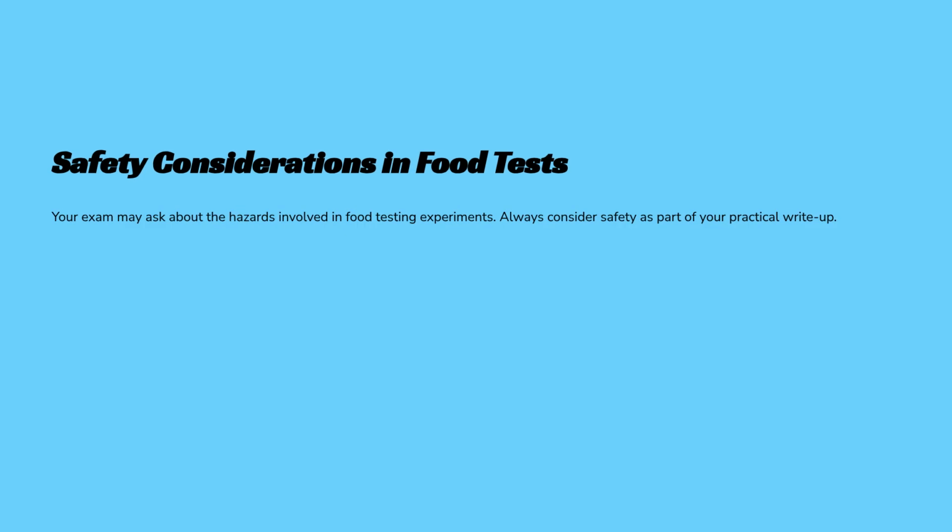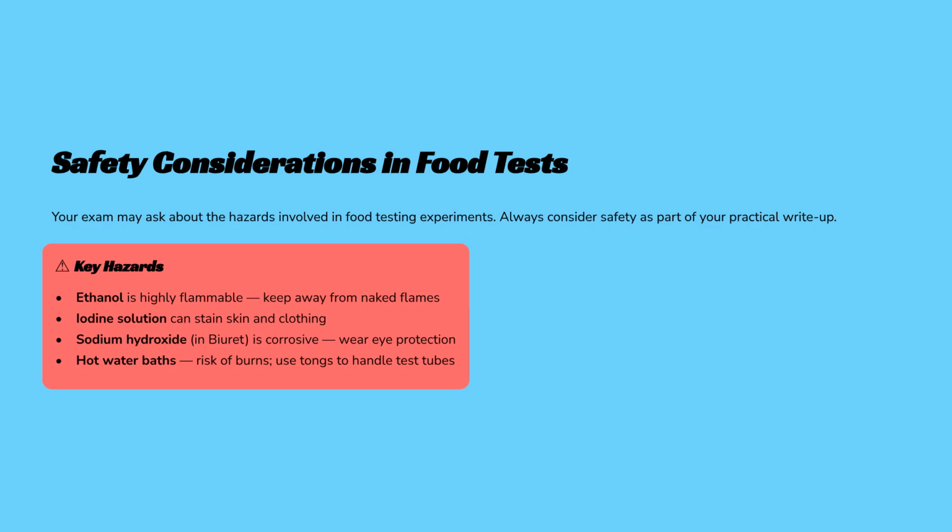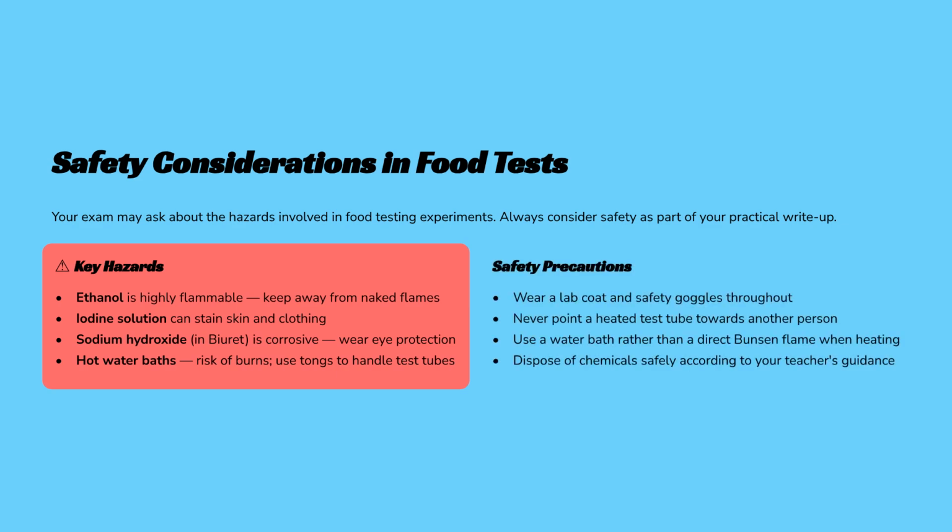Safety is paramount in any lab environment. Remember these key hazards. Ethanol is highly flammable, iodine stains, sodium hydroxide is corrosive, and hot water baths can cause burns. Always wear your lab coat and goggles, and never point test tubes at yourself or others.